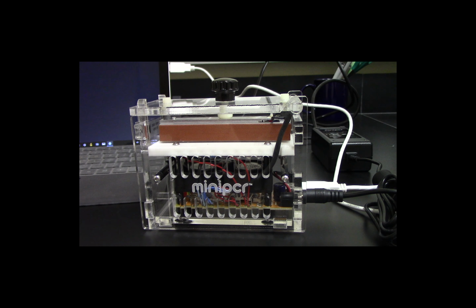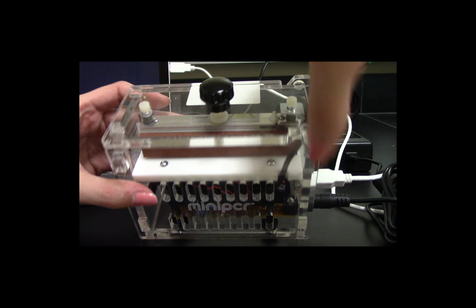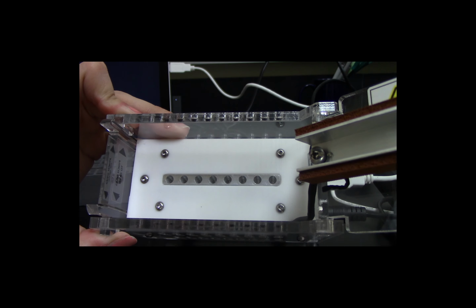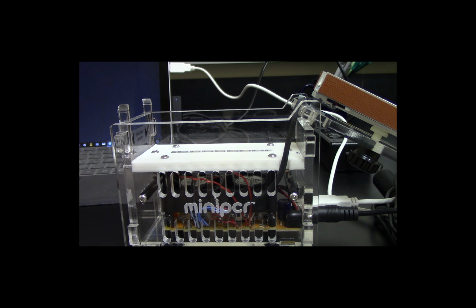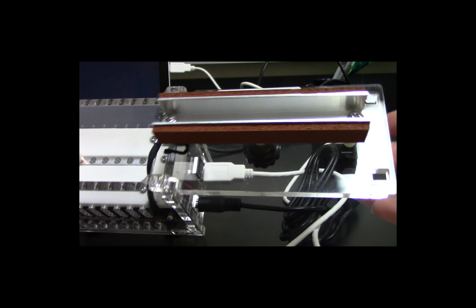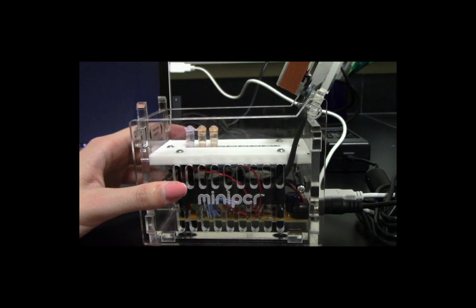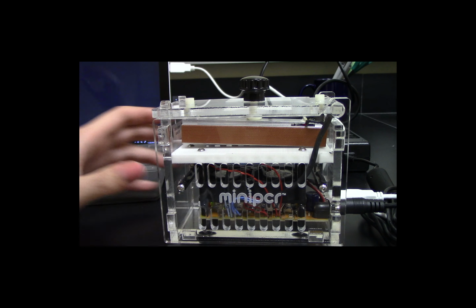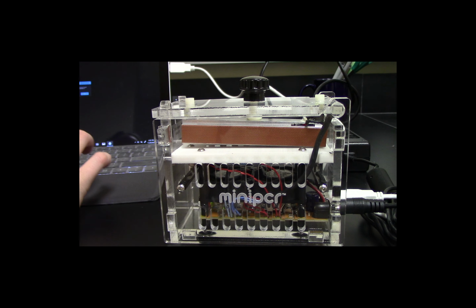Now that I have my PCR samples ready, I am going to open up the MiniPCR by pressing these 2 buttons in on the side and popping the top open, and that's where I'm going to be placing my samples. So I'm going to put my tubes in, and be careful not to touch this metal part, it gets hot, and then pressing that shut. And then I'm going to go and press run. And I'm going to start running my PCR.